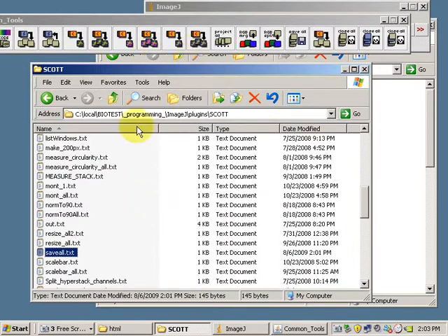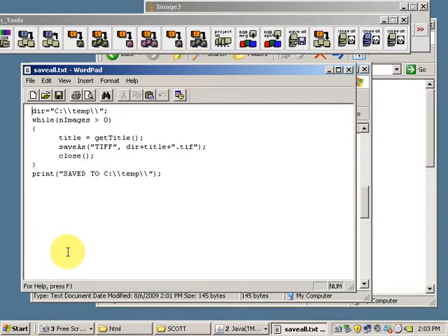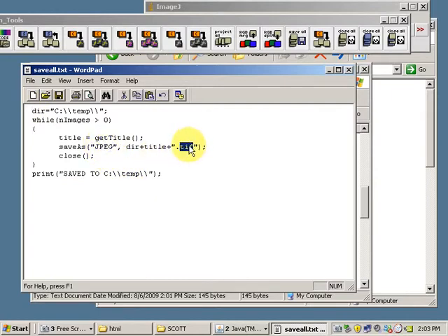So I can open this, and this is the small script. It's set to save as TIFF. I can make it JPEG, J-P-E-G. Add JPEG at the end of the file. Click Save.